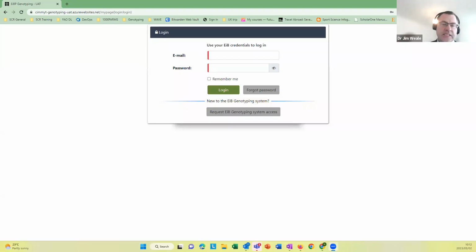I was involved with the production of this software from the beginning. Just to give a bit of background that Nick has asked for, I think Enghwa has covered what needs to be achieved in the future. One of the key aspects of this software, as you'll see as we go through it, is Scriptoria, the company that designed it, is really focused not simply on producing data systems, databases that are cutting edge, but that are very user-friendly.